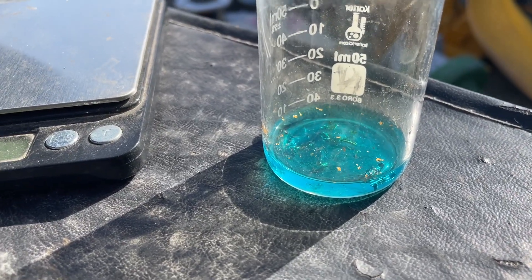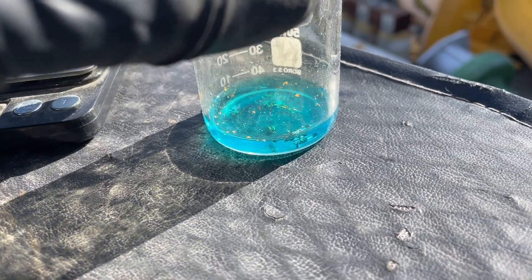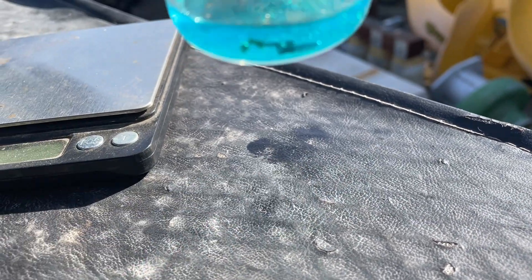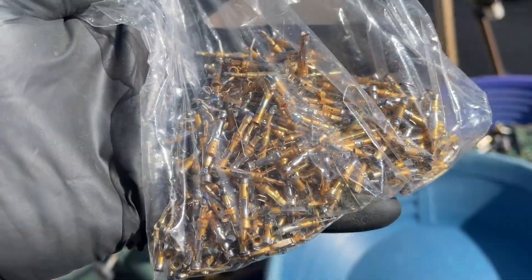So yeah, it's going to be a good methodology — dilute nitric to get the gold off those pins, and then all the stainless will remain untouched. Then we'll process that gold after that. Got those pins cleaned up pretty well.